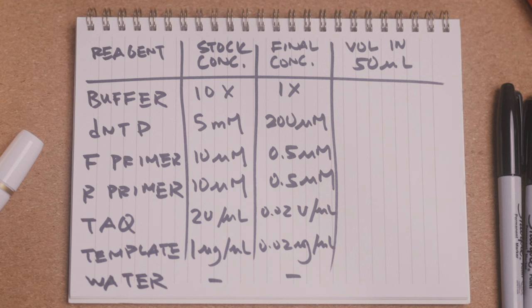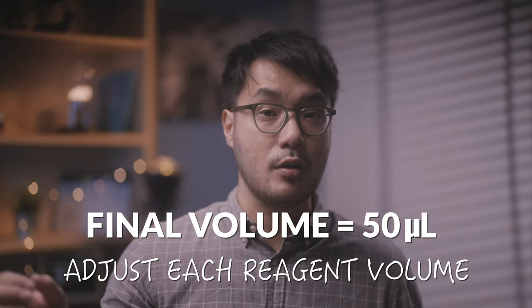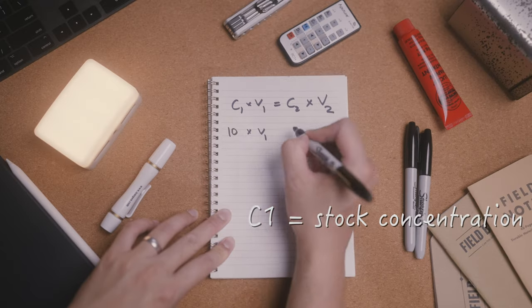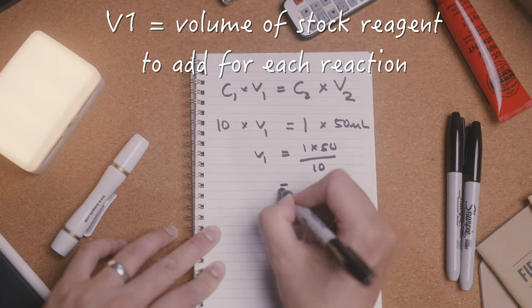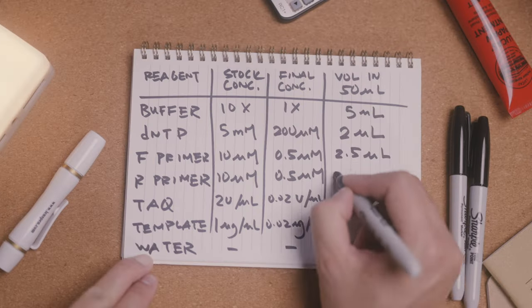Here are the standard concentrations for reagents we need — the original or stock concentrations, as well as the final concentrations in the PCR reaction tube. The total reaction volume for a PCR that we will use is 50 microliters, so the volume of each reagent needs to be adjusted in the right proportions to match this final volume. To do this we can use the C1 times V1 equals C2 times V2 formula. We know C1 the stock concentration, C2 the desired final concentration, and V2 the final volume of 50 microliters in each reaction. A bit of algebra and we can calculate V1, the volume of stock reagent that should be added to each 50 microliter PCR reaction.